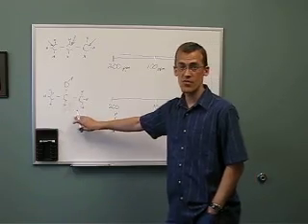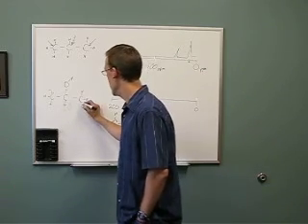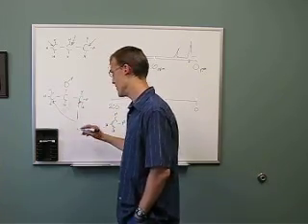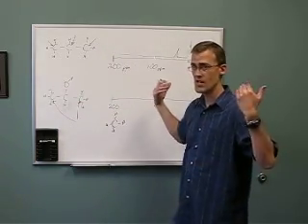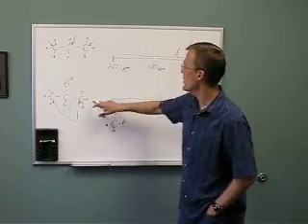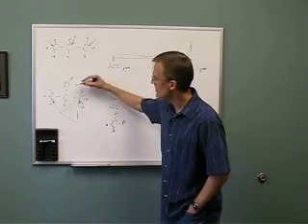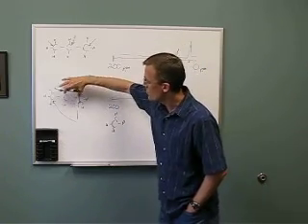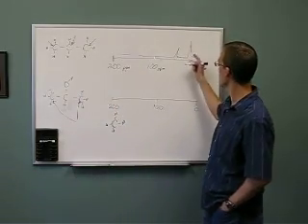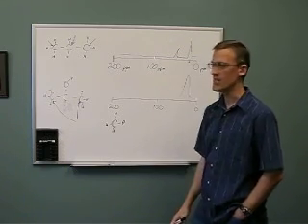Alright, first thing I'm going to do here with the propanol is once again look for how many unique carbons there are. And like before, I think this first one and the last one are pretty much the same. And they're going to be the furthest upfield or to the right. Now, this carbon here, compare this terminal carbon with the terminal carbon in propane, this one is actually going to be further deshielded, even though it's not directly attached to this oxygen. This oxygen is pulling electron density because it's very electronegative. So this group is going to be downfield a little bit more than what we saw in the first case.